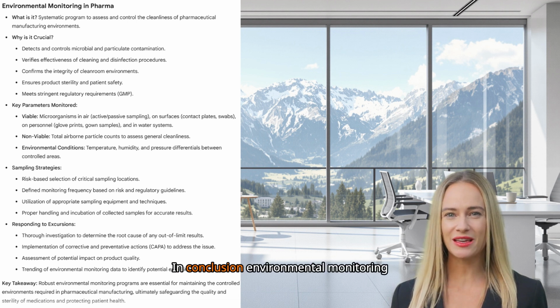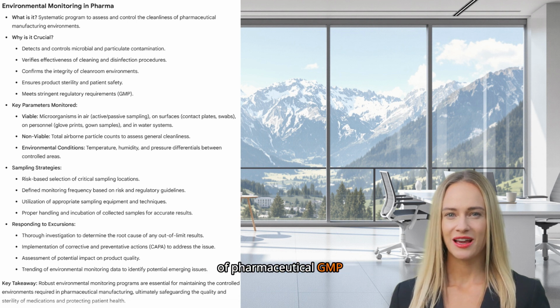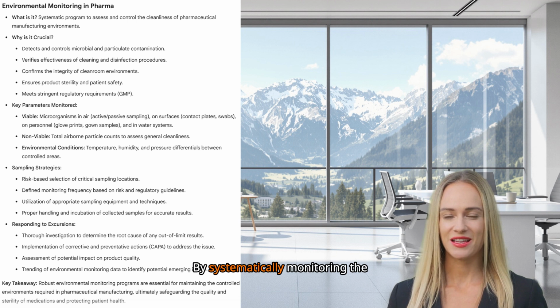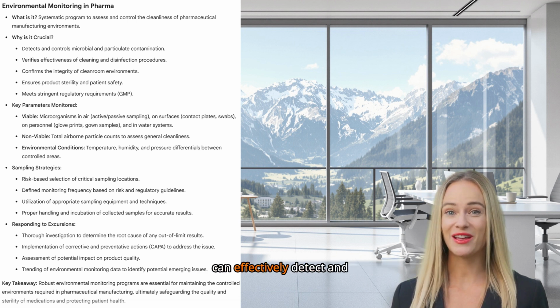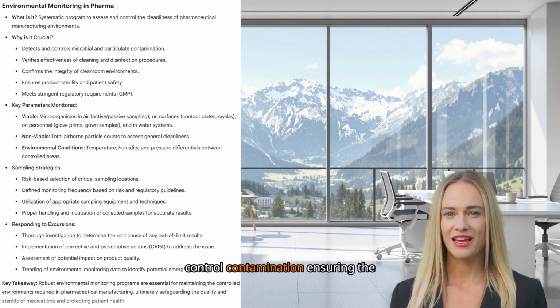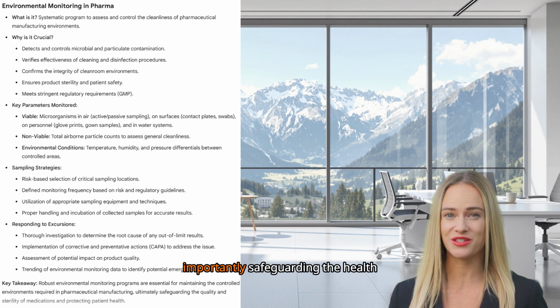In conclusion, environmental monitoring is an indispensable element of pharmaceutical GMP. By systematically monitoring the manufacturing environment, pharmaceutical companies can effectively detect and control contamination, ensuring the sterility and quality of their products and, most importantly, safeguarding the health and well-being of patients.